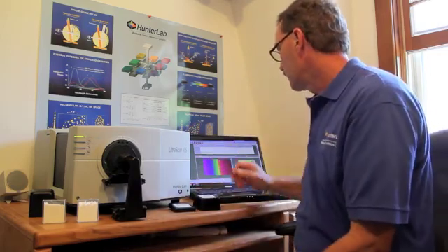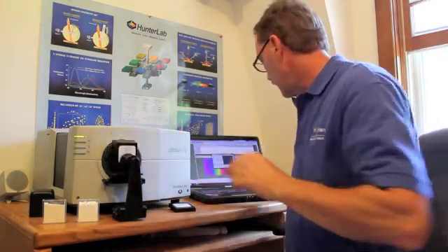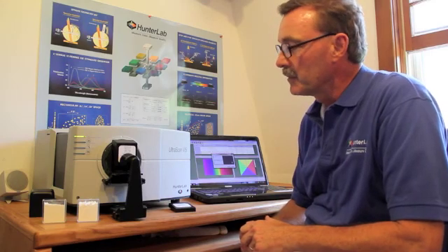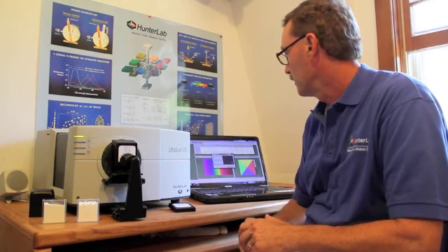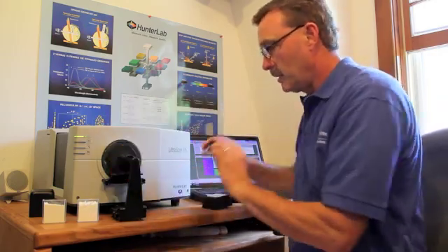And proceed, measuring the light trap, which sets the bottom of the scale. We'll proceed to read the white tile.